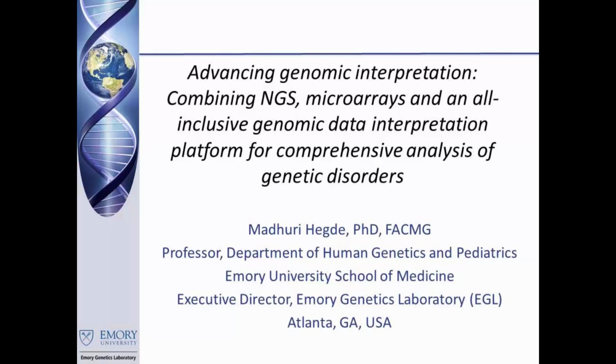The second project I'm going to talk about is something that James just mentioned, working on clinical interpretation software. It's something I've been thinking about for a very long time, and I'm glad it's coming together in a clinical format. So I'll show you the concept behind what we are trying to put together in this software.